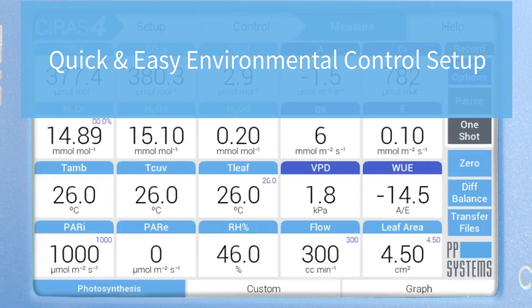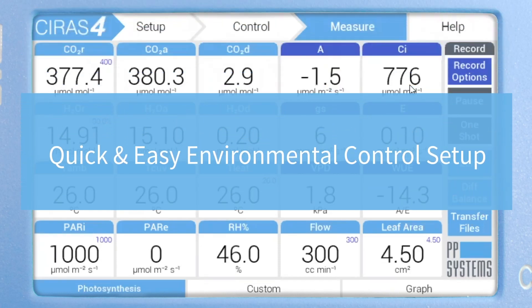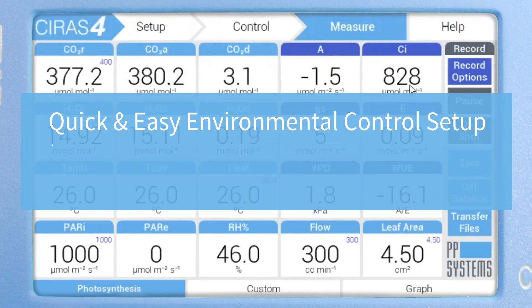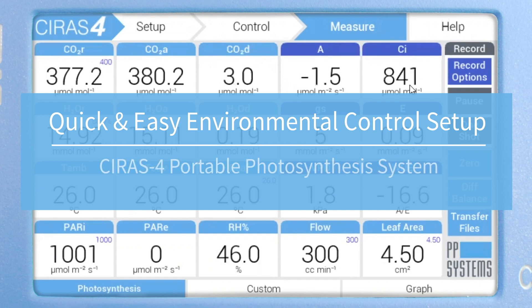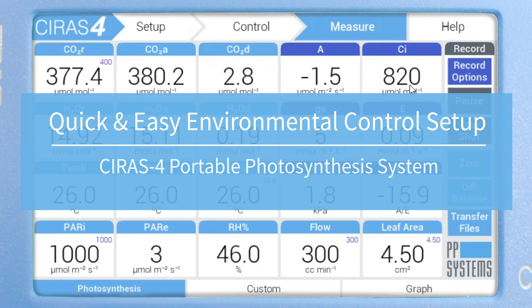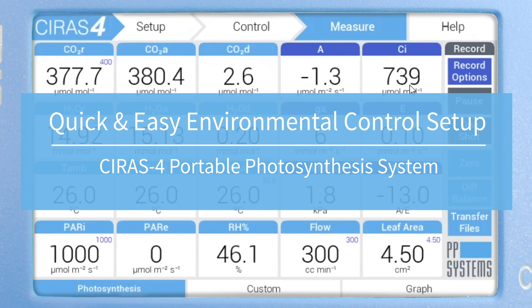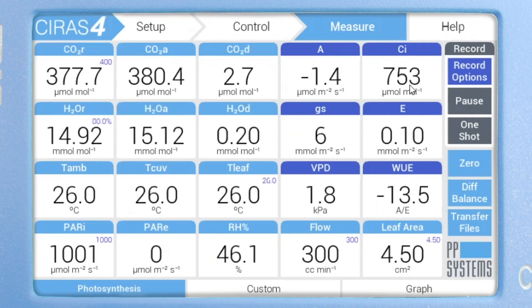In this video, we'll demonstrate just how quick and easy it is to set all environmental controls for CO2, H2O, temperature, and light on the CIRIS4 portable photosynthesis system, all of which can be set individually or through easily programmed scripts for automated response curves.